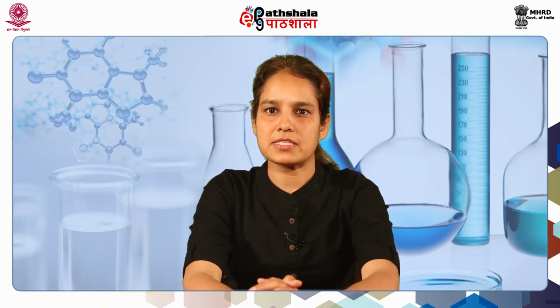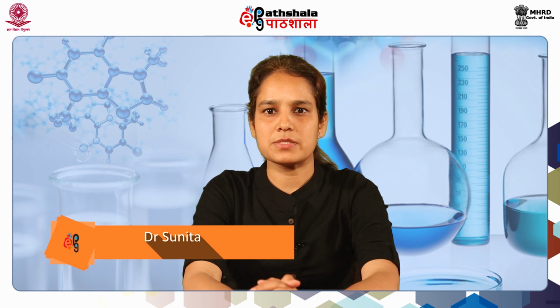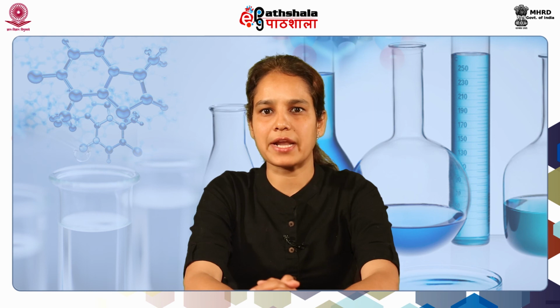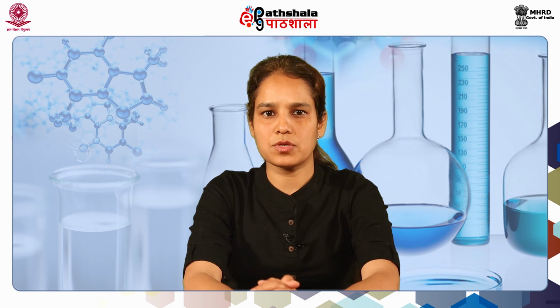Dear students, if I summarize what has been covered in today's presentation, I can say UV-visible spectroscopy is a very powerful spectroscopic method for identification and quantification of analytes. Visible range is used for colored solutions, while UV range is used when molecules have characteristic bonds. The glass cuvettes are used for visible range, and quartz cuvettes can be used for both the UV and visible range of electromagnetic radiation. Concentration of analyte can be calculated from its absorbance and the molar extinction coefficient.